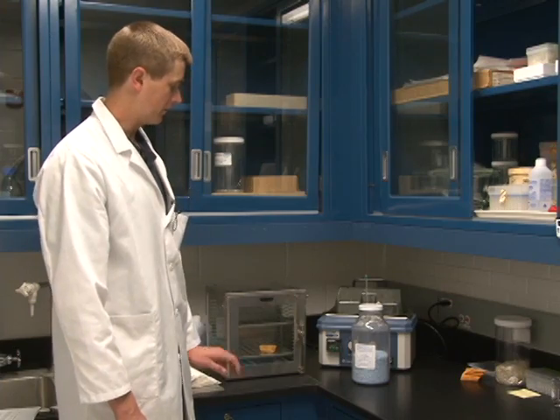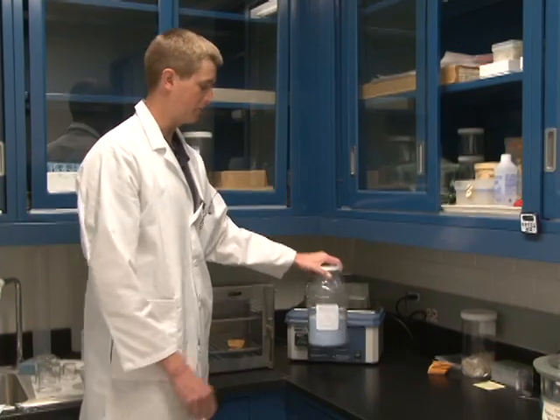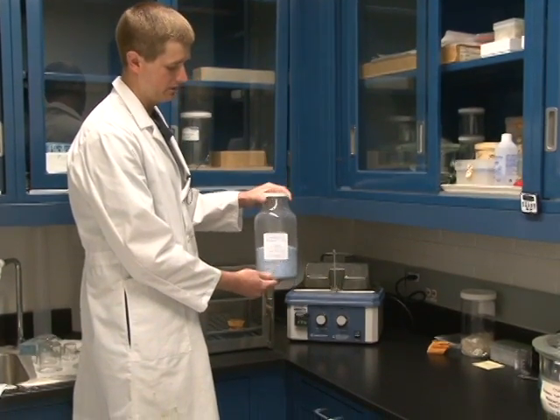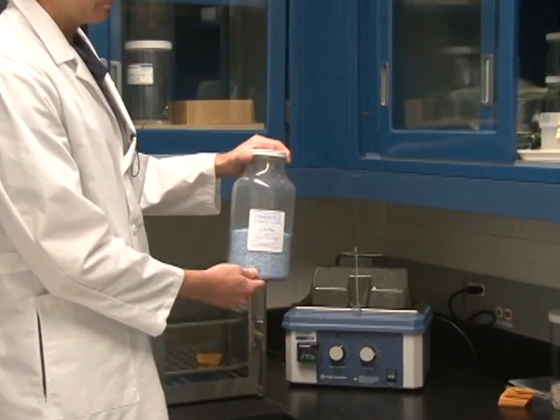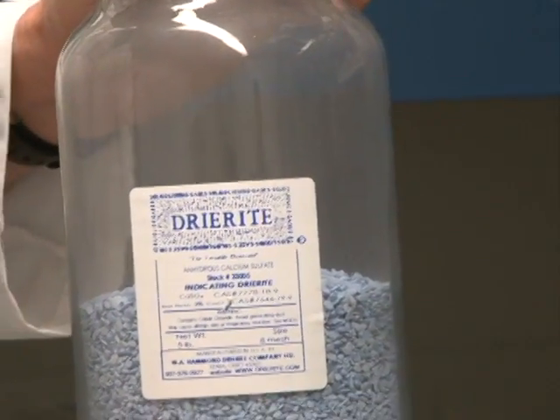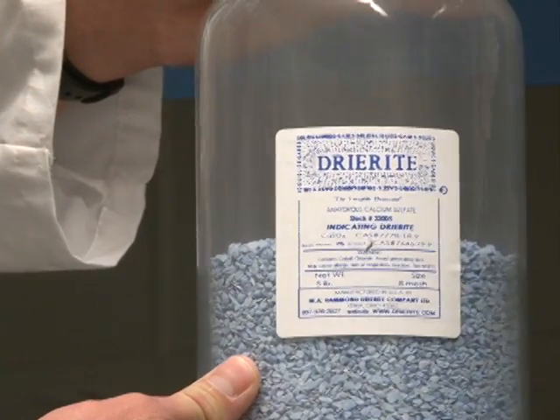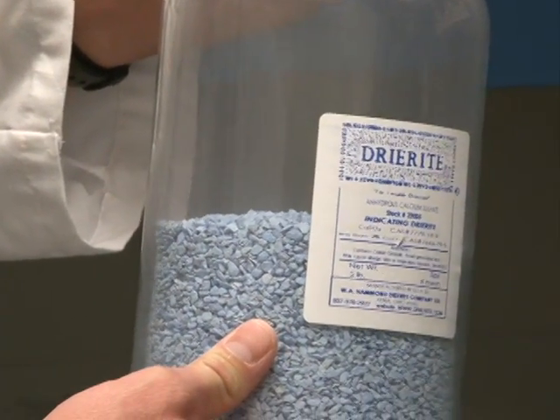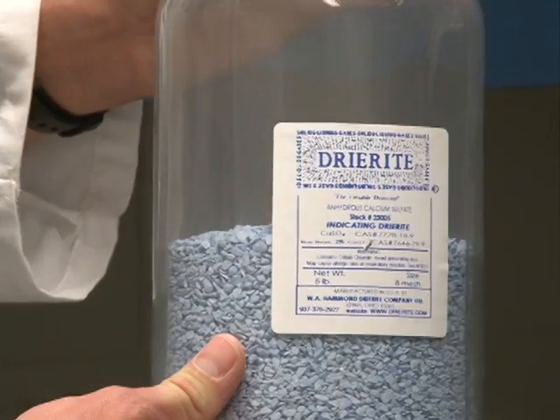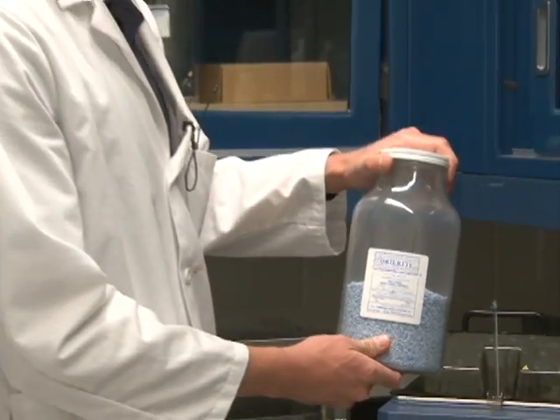Another form of desiccant you might use is silica gel. What's also interesting about these desiccants is they usually come with an indicator dye. You can see that this desiccant here — the anhydrous calcium sulfate — is colored blue. Once it has absorbed all the water it can absorb, it will turn pink. You can simply place the desiccant in an oven to dry it back out and make it useful for drying spores once again.